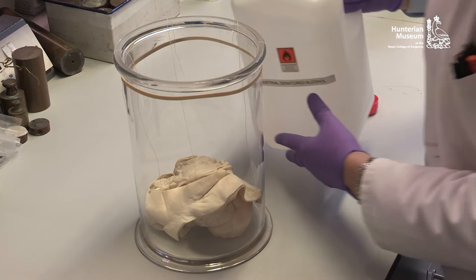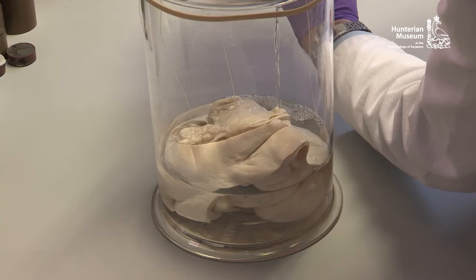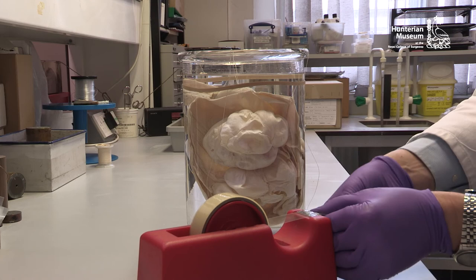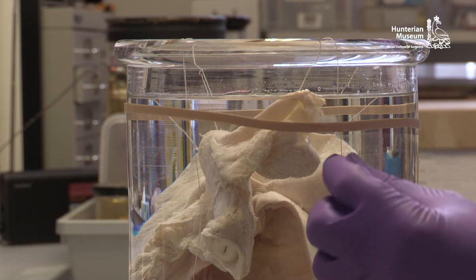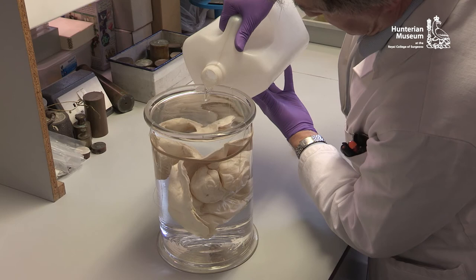The jar can now be filled with preservative fluid. Once the specimen is correctly positioned, sellotape can be temporarily used to secure the threads until the sealant is applied. The preservative fluid can now be topped up. It is essential to leave an airspace to allow for fluid expansion.